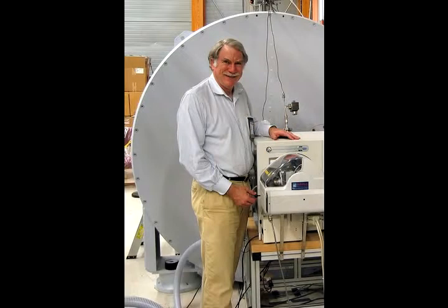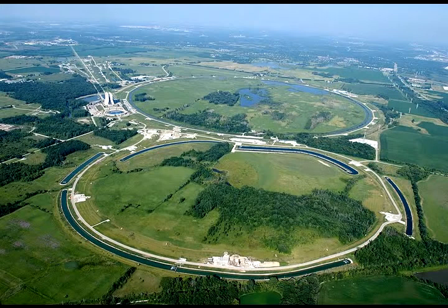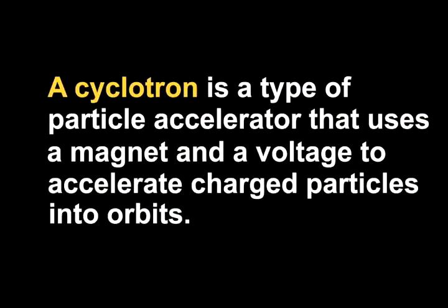I'm Alan Marshall. I direct the ion cyclotron resonance facility at the National High Magnetic Field Lab. Basically, what we have here are little cyclotrons. They're a couple inches around. You're used to hearing about ones that are 12 miles around. Those are used to accelerate particles to very high energy. That's not what we do.